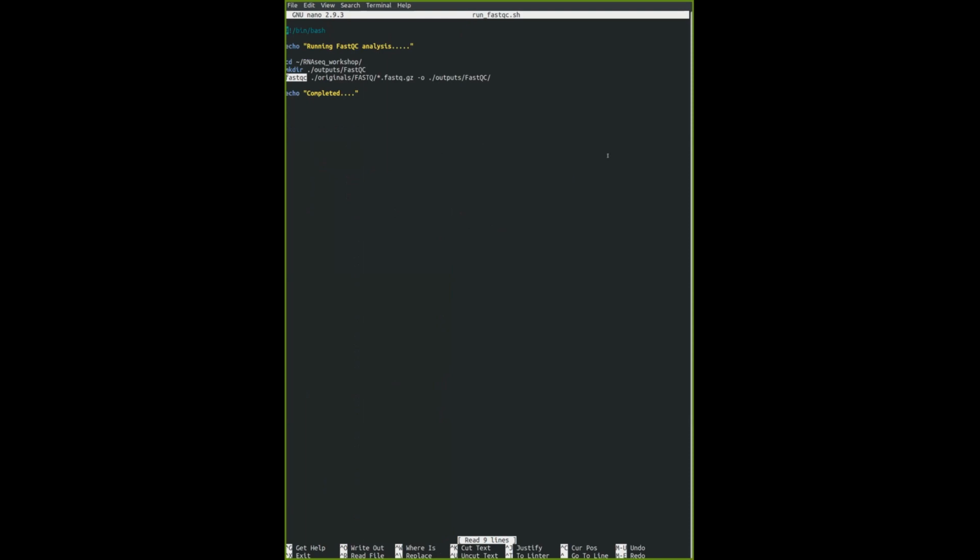The asterisk in the line, is it superscript? Which one? This asterisk? Yeah. No, it's shift 8. So there's this star sign or asterisk sign when you type in shift 8. This is again the wildcard that basically picks up any pattern in this directory that ends with fastq.gz. Okay, give it a try.